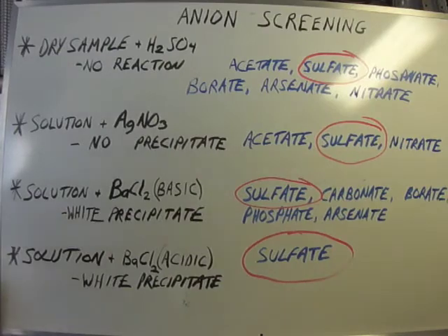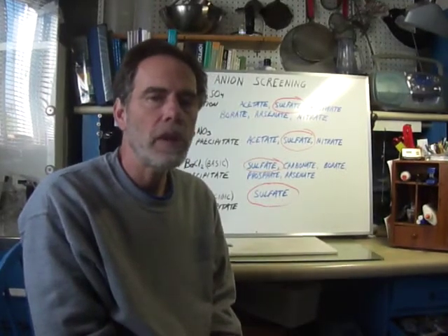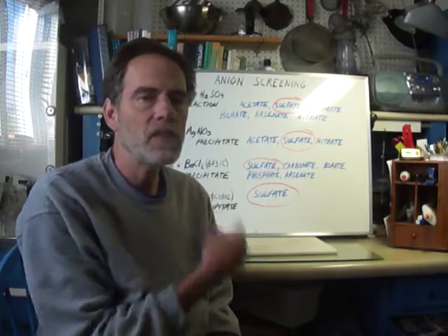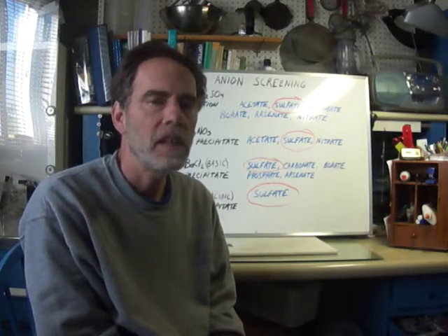So that was interesting. Well, it looks like I got off easy again. The sample procedure seemed to go pretty quickly to come out to the answer. But even so, doing these 3 screening tests would definitely narrow things down to at least a handful of candidates that you can go back and do confirmation tests on, rather than the whole list.